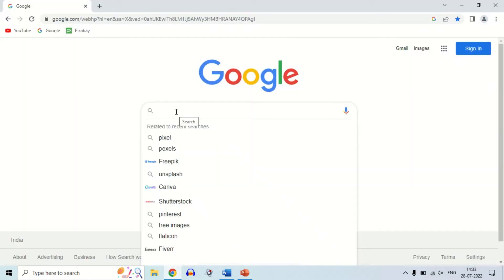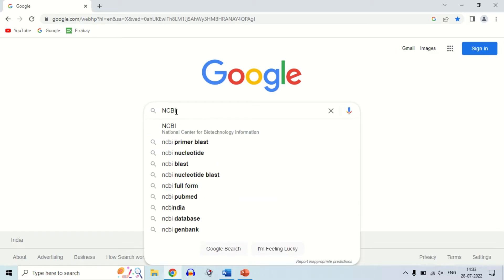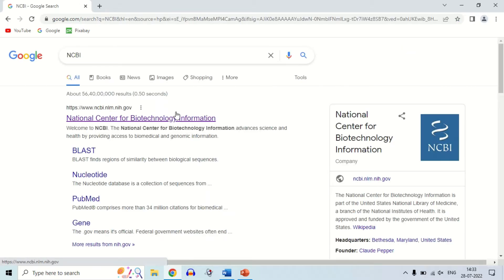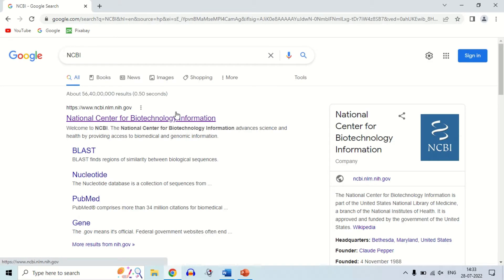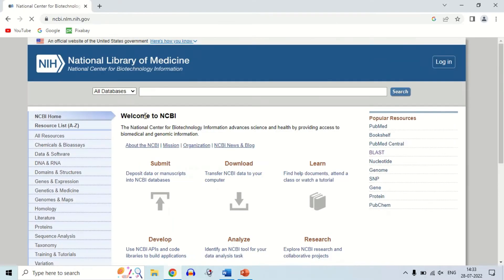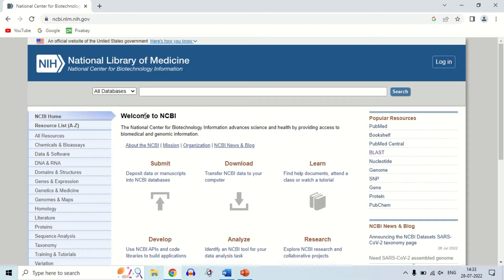So as I open Google Chrome, you have to search for NCBI in Google. Now this is the website of NCBI — click on the website. You can perform BLAST directly from the search results as the option is there also, but I will show you by opening the website itself. So as I click on the website, this is the homepage of NCBI.